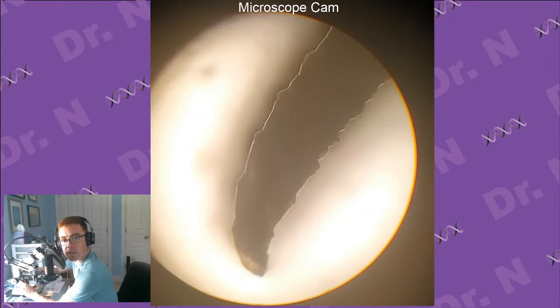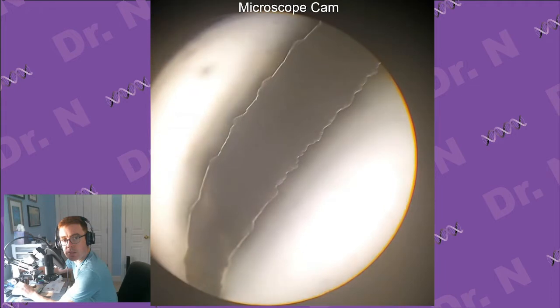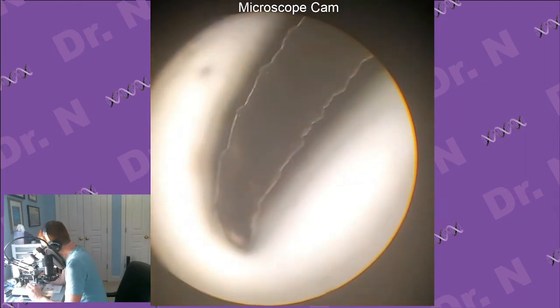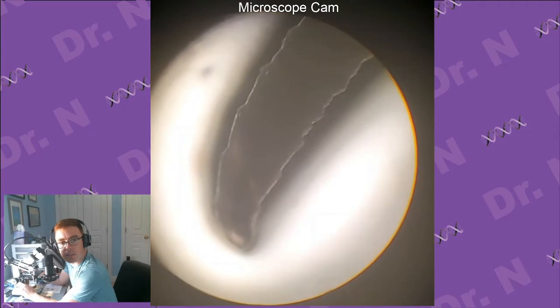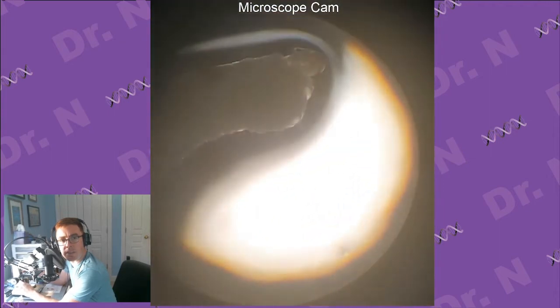Okay, so I'm not surprised, but this is just about as good as I'll be able to see with just this microscope. I don't think we'll be able to see much more through it. They're normally pretty clear, but these guys ended up turning a little opaque while they were being preserved. It's not much better through the eyepiece, so it's not necessarily the camera. This microscope just wasn't made for something like this, so that also doesn't help. Changing the aperture doesn't really do anything.